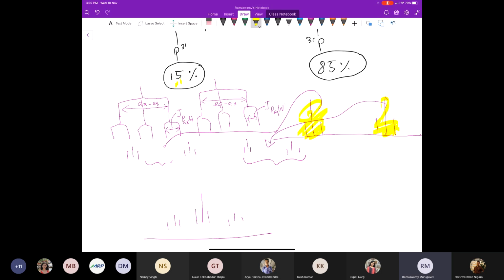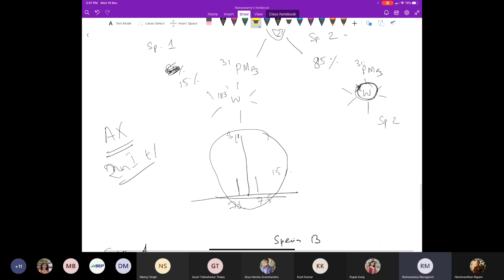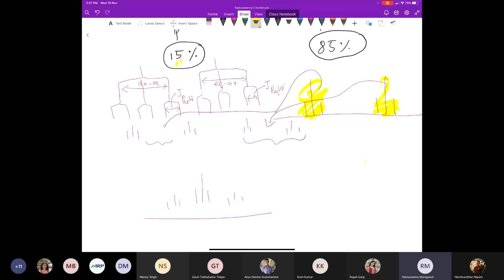The satellites are going to be spaced the way you had one main peak here and two satellites this way. In the same way, each of the triplets will have two minor triplets, which is due to the tungsten coupling. That's all it is. I may not be drawing it with equal heights, but roughly, as I said, 1 to 10 to 1, the final spectrum. That's the spectrum. If this is clear, we're already at 310.